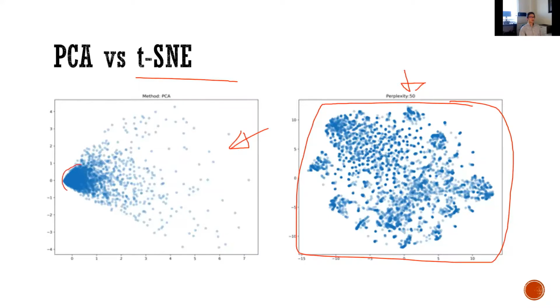See here, there are a lot of cells, data points, being put onto each other, even in a very small area of space. It's very crowded. However, tSNE will give you a representation which is much more spread out.